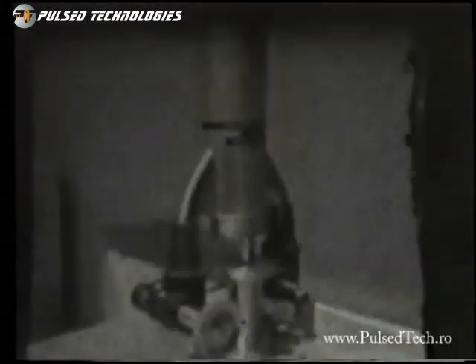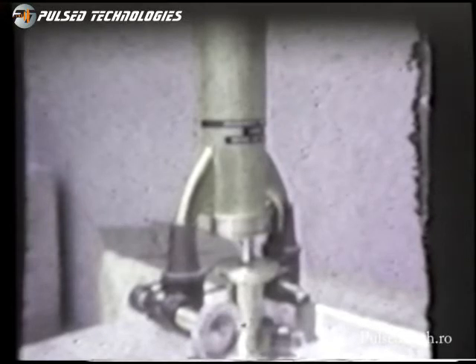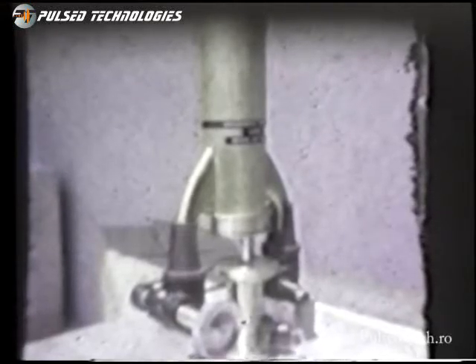This is an external view of the first projection microscope, which is now in use here in San Diego by an MD for his own private research. This is a front view of the instrument showing the dial on the left-hand side, which operates two twin jack screws that move the microscope up and down to bring the object into focus.